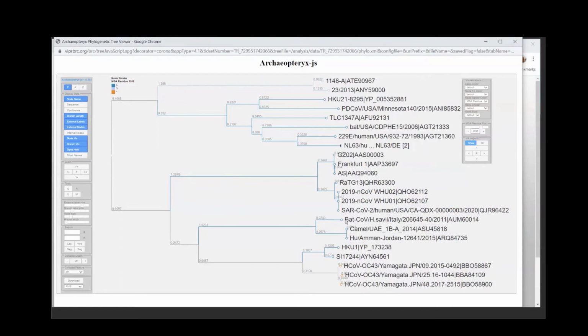Or for example, if we are interested in comparing this sequence here, we will measure this part, this part, this part, this part, this part, and this part. The vertical lines are just for the purpose of drawing, so they don't have any biological meaning, so to speak. Only the branch lengths you see here are the ones which are real. Again, comparing this one, we measure this one here, and this one here.